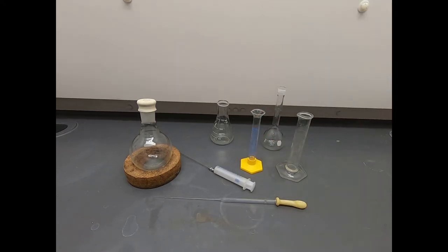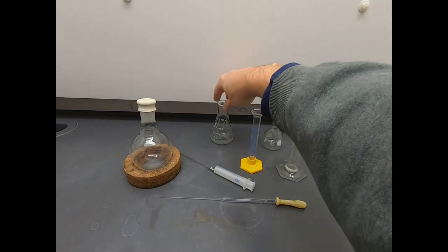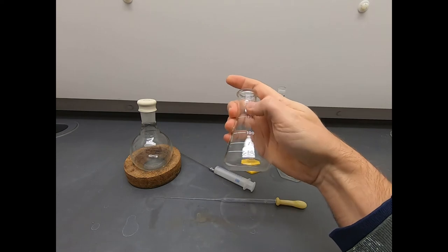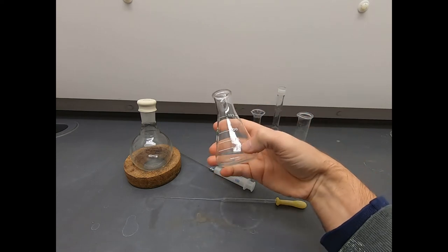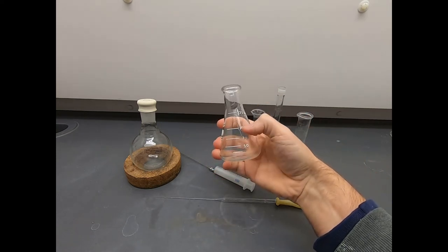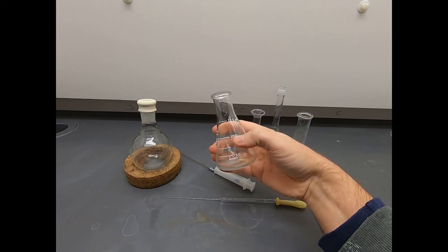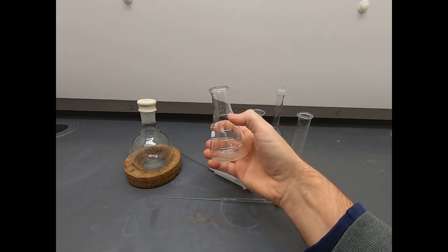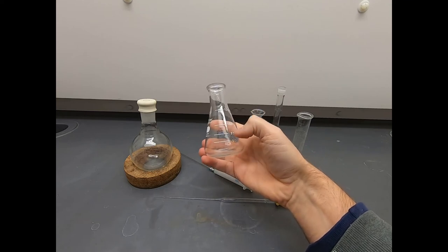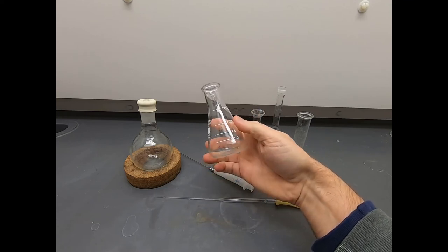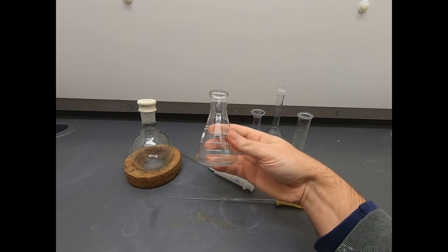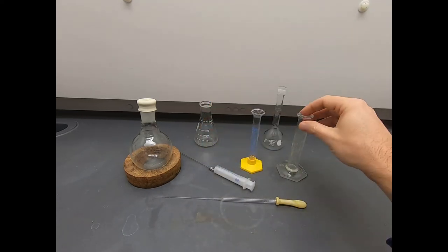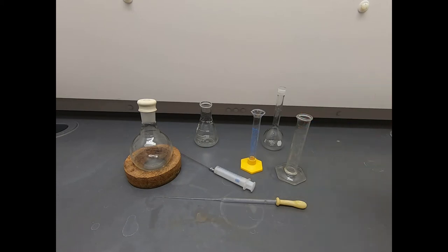Now you may have seen graduations on other glassware. For example, here is a nice Erlenmeyer flask and it has graduations. And it might make sense to you, well, I'll just use this to get my 100 mL of solvent. That may be okay for your use case, but these graduations on beakers and Erlenmeyer flasks typically are very rough estimates. So if you want to have some confidence in your number, then I would recommend using a graduated cylinder instead.